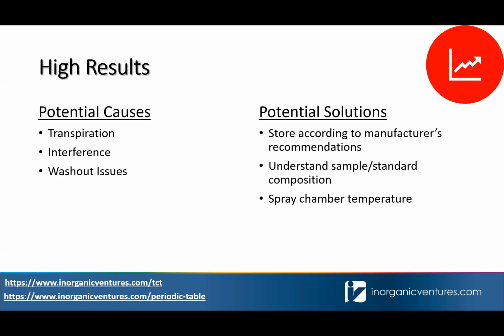And what you'll get here is improved detection. You'll have a longer term stability of your signal, and your calibration results will improve if you're having issues with that. And then finally, washout issues. So sticky elements tend to be problematic. So your boron, your molybdenum, mercury, for example.